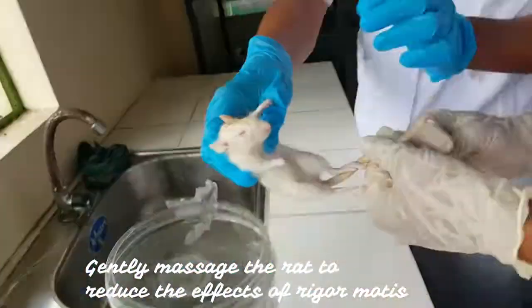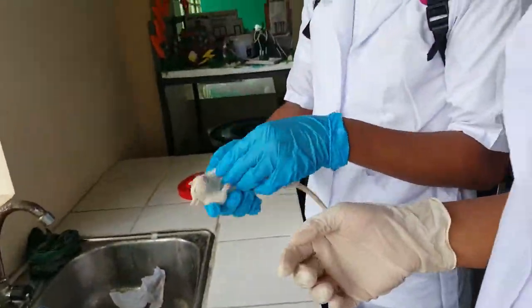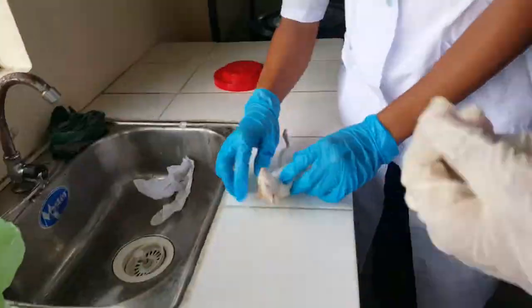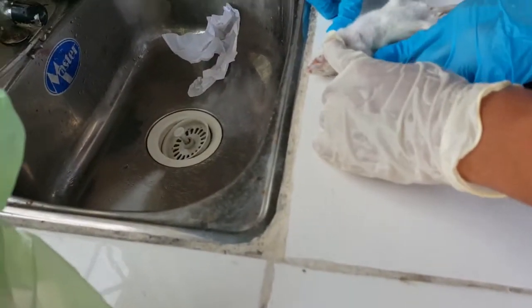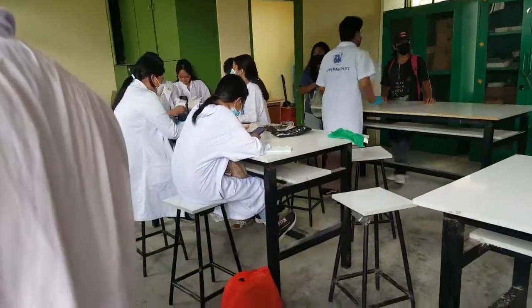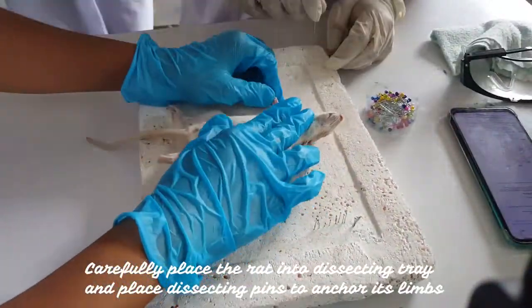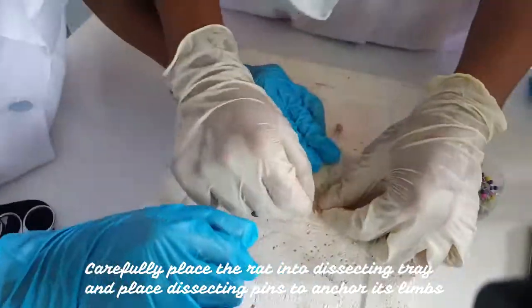Massage the rat to reduce the effects of rigor mortis. Carefully place the rat into the dissecting tray and place dissecting pins to anchor its limbs.